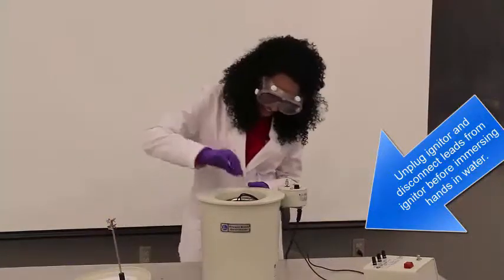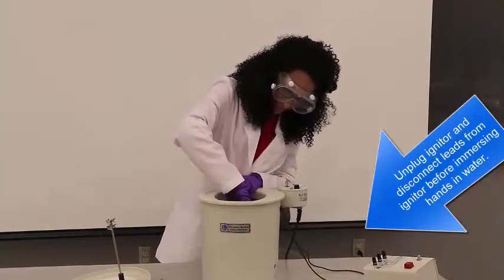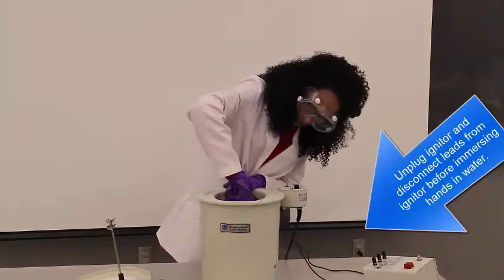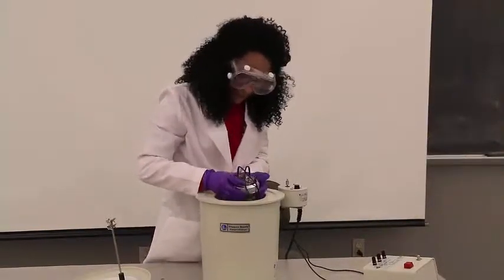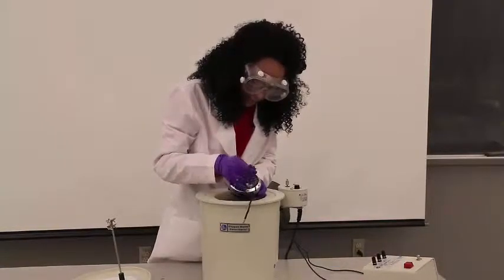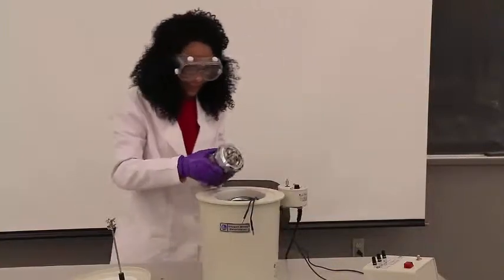After the temperature rises, let the final temperature stabilize for 2 to 3 minutes. Make sure to unplug the igniter and disconnect the wires before moving forward. Remove the gasket and the lid from the system. Remove the wires connected to the bomb and then move the bomb from the calorimeter pail.